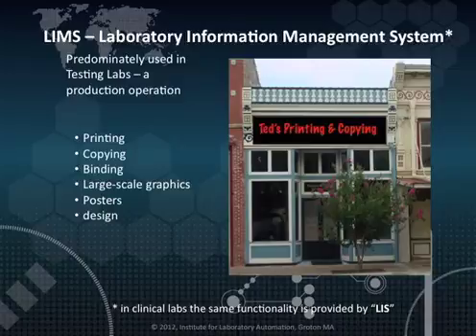To illustrate the use of a laboratory information management system, or LIMS, we will come back to an example that we used earlier, that of a printing or copying operation that also includes binding, large-scale graphics, posters, and graphics design work. One problem that a business like this has is keeping track of the work in progress, what work has to be done, and answering customer inquiries about the status of their work.